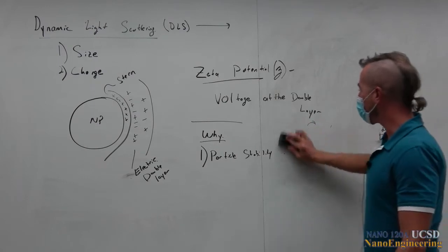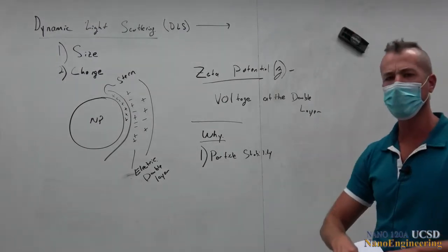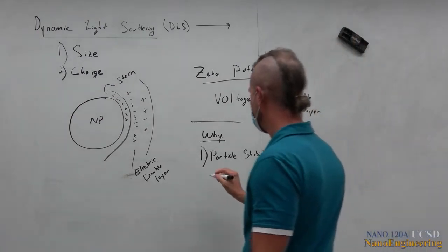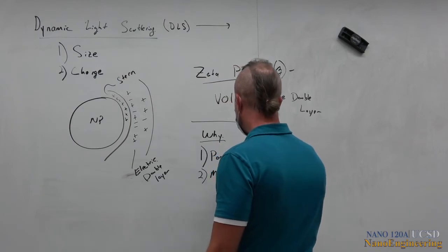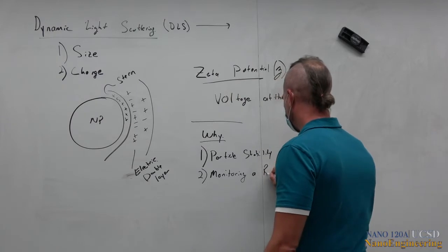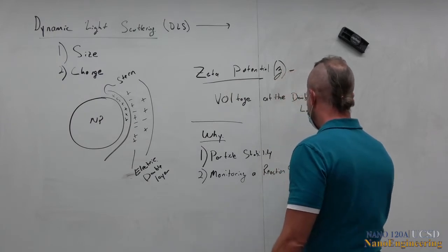The other value that really comes with zeta is in monitoring a reaction step.